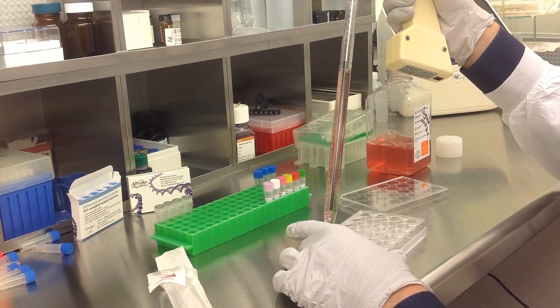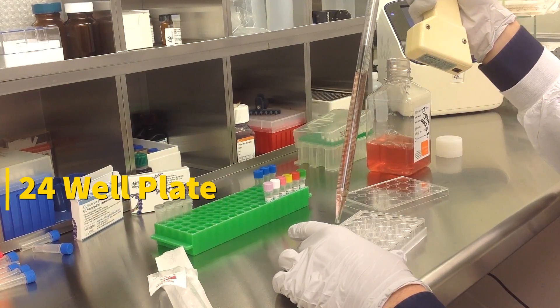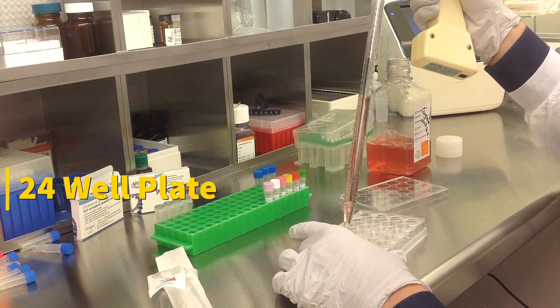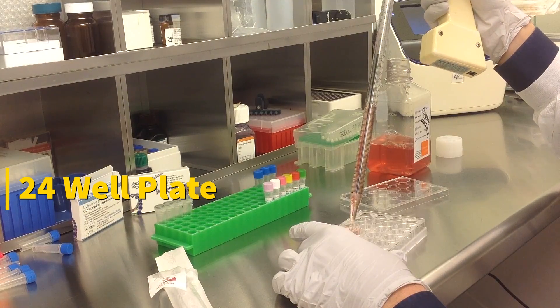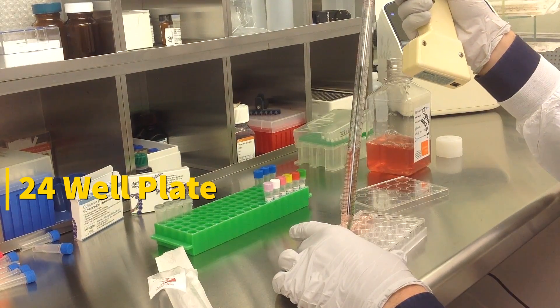Today we will be transfecting FADU cells obtained from ATCC, using a transfection kit manufactured by Altagen Biosystems. In this tutorial, we use a 24-well plate. Transfections can be scaled up or down based on plate surface area as described in the corresponding transfection protocol, which can be found at altagen.com.